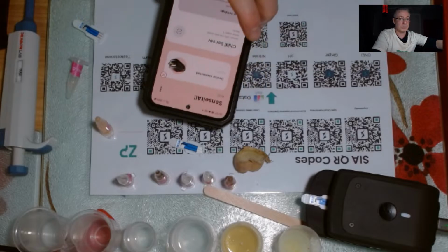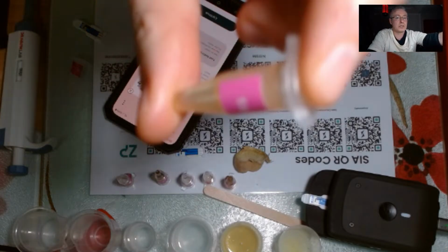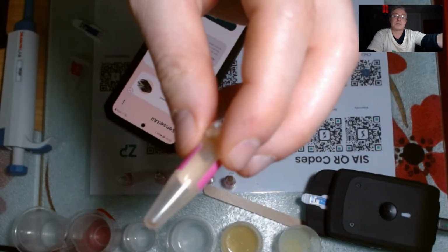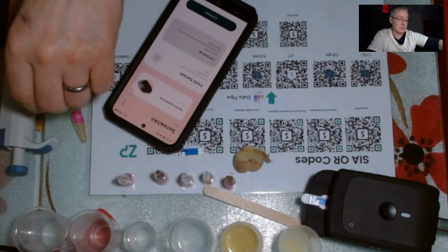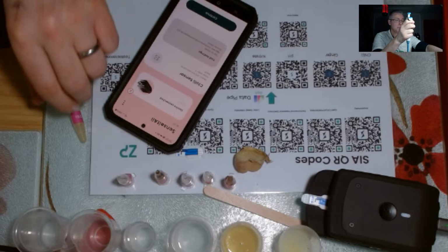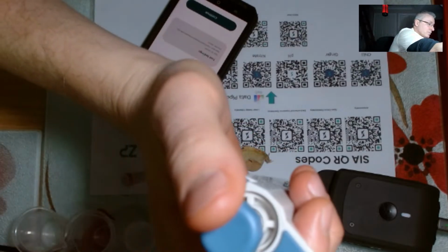There we are. I've got it in chili mode now. Right, so even though I'm going to be testing dopamine, let's talk about chili. The nice thing is I think they were trying to test dopamine in urine. So the nice thing about electrochemistry, this is a sample I'm going to test. Again, it's not the world's cleanest sample, but that is the benefit of electrochemistry. I might grab a slightly cleaner pipette tip though. So I'll grab the pipette tip and put 50 microliters onto the sensor, which I do now.